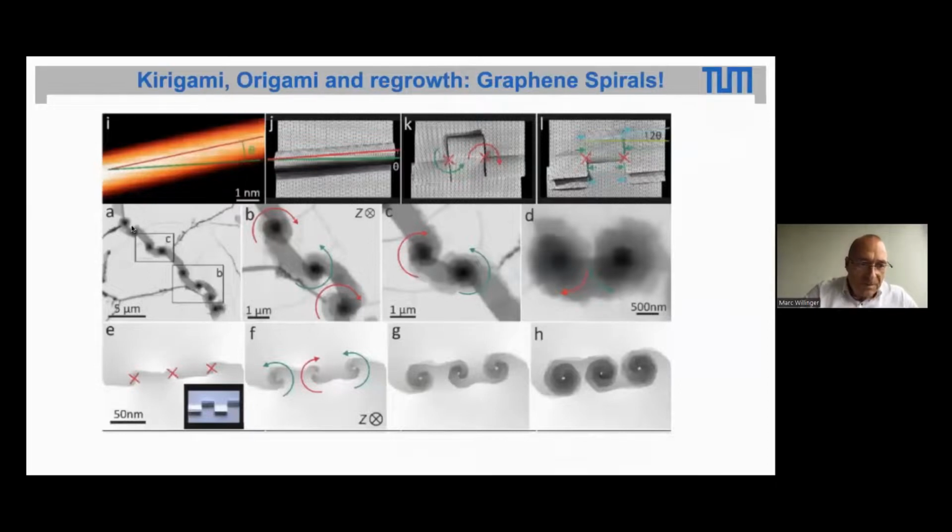So we have a fold, that fold falls to the left or to the right, and in the center where the fold happens, you get graphene spirals. Now each side has a different Burgers vector, so you have 2 spirals that are growing twisted layer graphene. And in the end, you get this twisted layer graphene of twisted layers stacked up together.